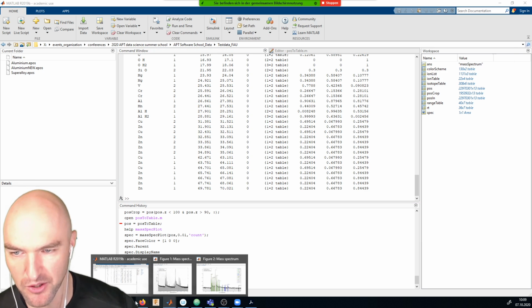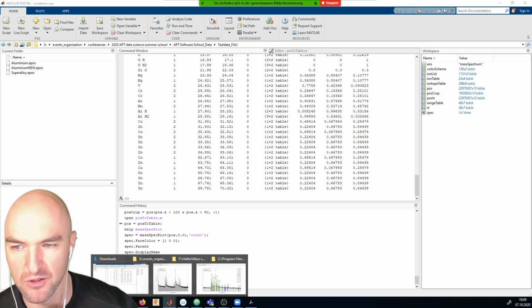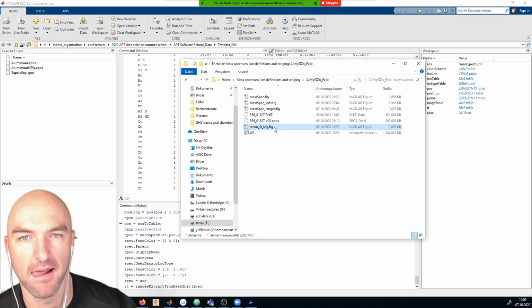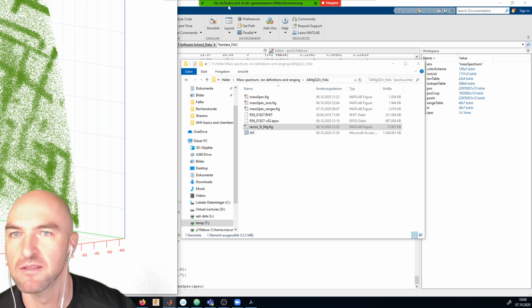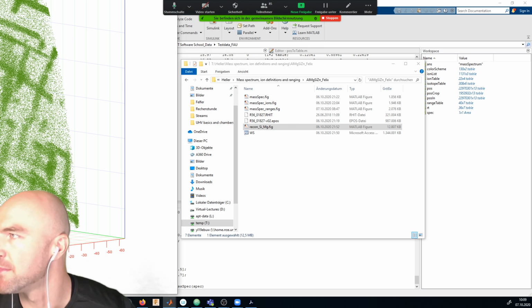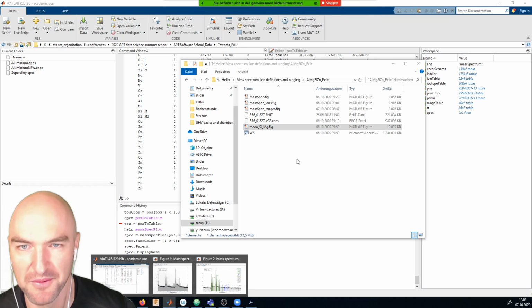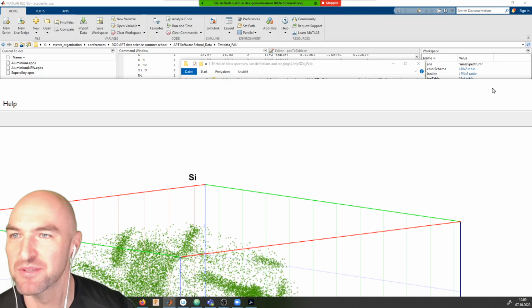And I can then use that to create a plot of various elements in various ways, and this just popped up in a way that, great, was not very size-wise.